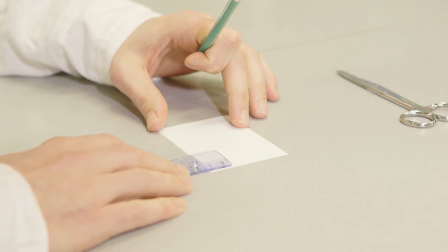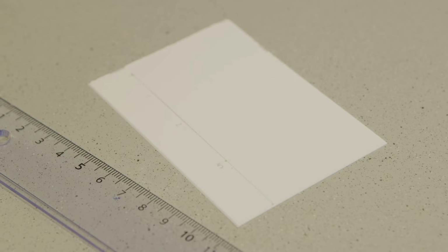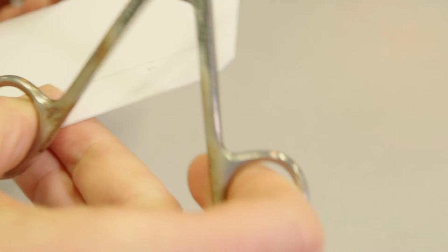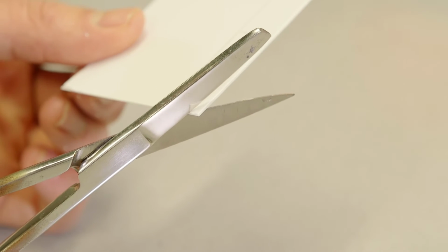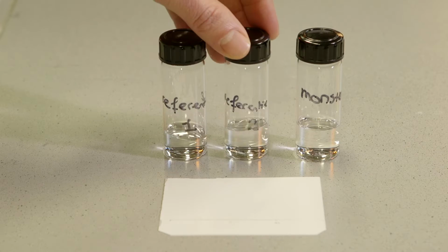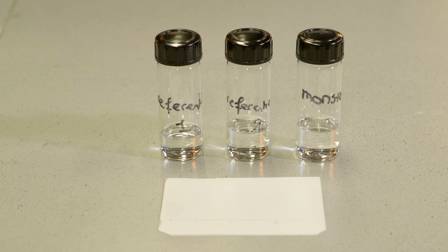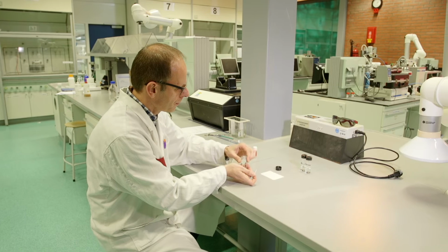A very thin line is drawn on the TLC plate 1.5 centimetres from the bottom edge with a soft pencil. The layer must not be damaged. The corners of the TLC plate are cut so that the solvent will rise uniformly. Dots are drawn on the line and are numbered to be able to identify the samples and the reference solutions.